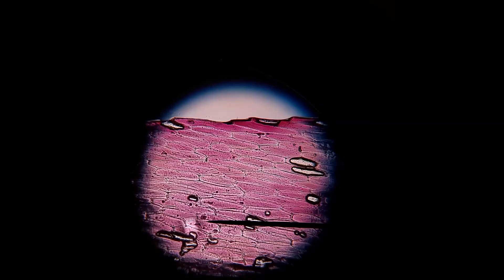So here's our first example of cells where the cytoplasm is thoroughly full. If you can see all the pink coloring there, that's all due to the red pigment that is present in red onion. These are all cells where the cytoplasm and the cell membrane is completely pressed up against the cell wall.